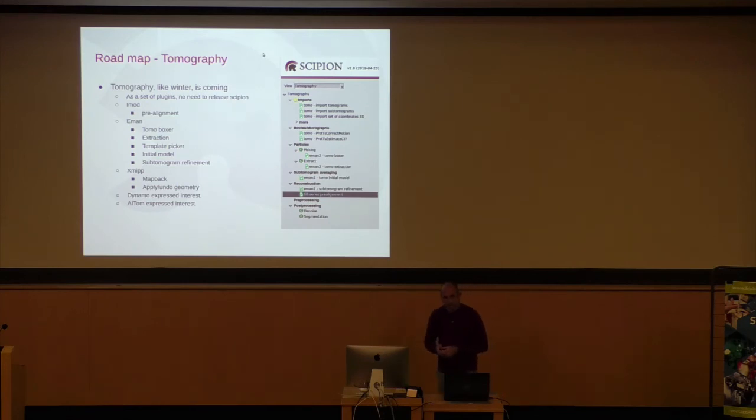Now, roadmap. I have a few slides about the roadmap. Tomography, like winter, is coming. We are working on tomography. This is not available yet. You will not see this in Scipion yet. But everything is being developed as a plugin. So as soon as we think everything is properly developed, we will release it and it will appear in your Scipion installations.